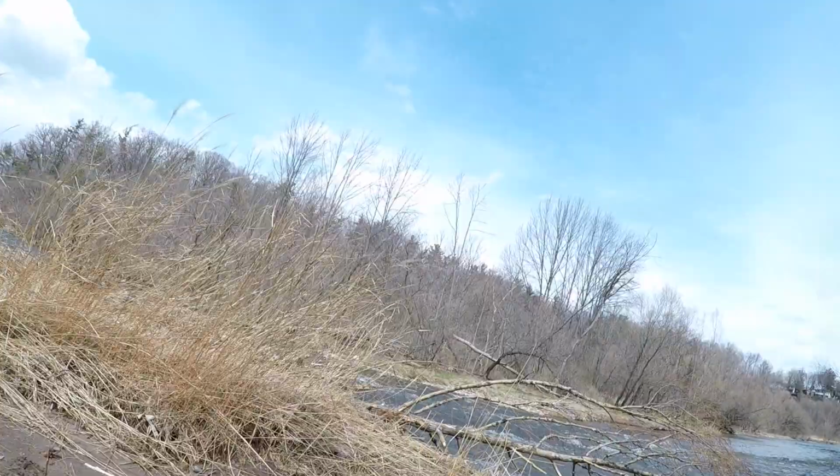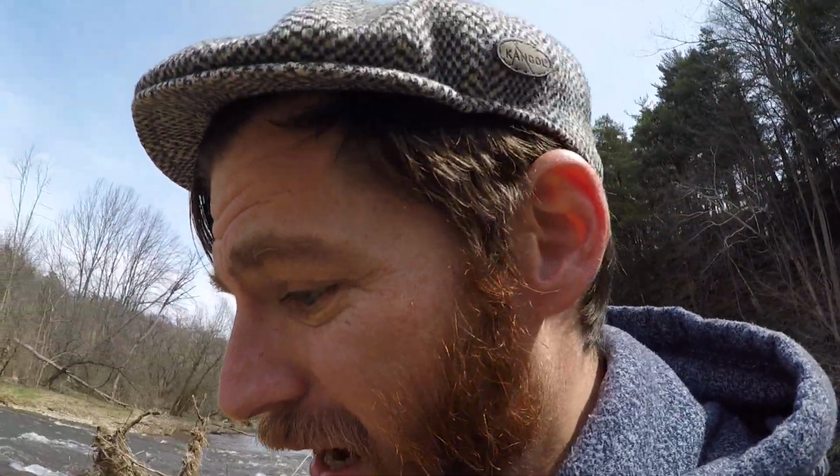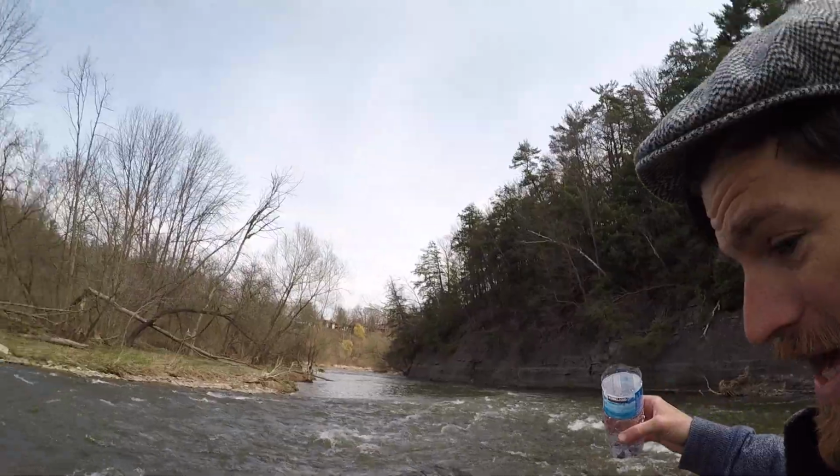Don't worry, we're going to check out the main channel and I'll show you hopefully a reading that is highly turbid, and if not, I can get Myra to help me and together we can show you one that's pretty turbid. Okay, so I'm going out into the Credit River. It's moving really quickly today.